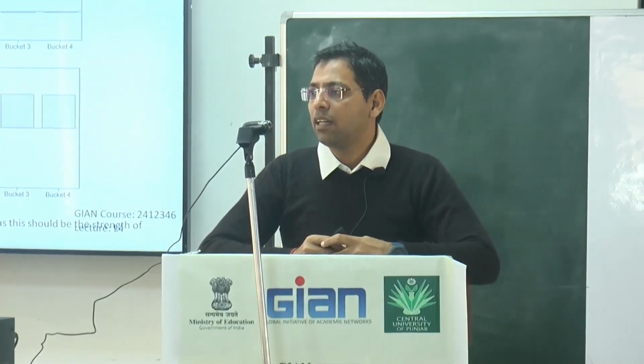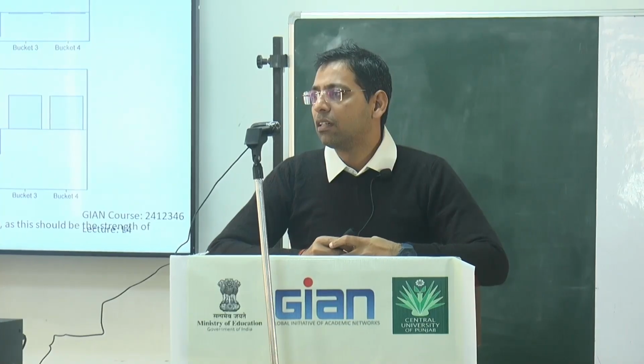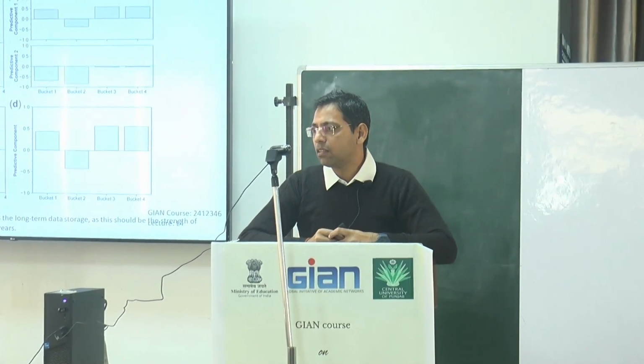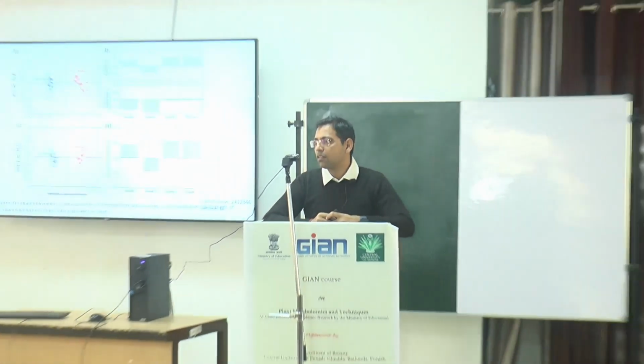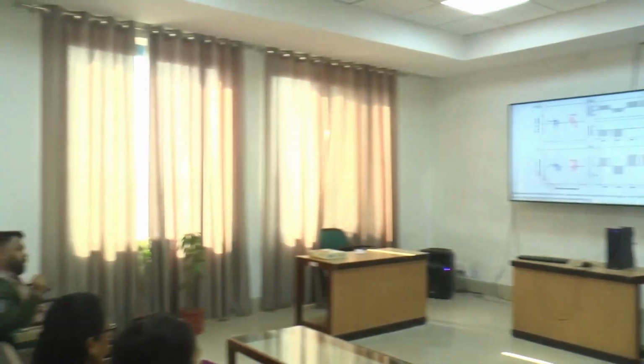So 1 ppm is equal to, you must be 300 megahertz or 300 hertz. Megahertz is 10 to the power 6, I think. We will discuss everything in the tutorial. उसमें हम सारा discuss करेंगे.